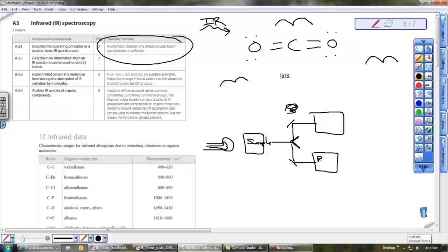Signals will go through a reference sample. That's your control. It's a comparison. It's a calibrated thing where it's like, okay, this is what a baseline is, and your sample, excuse me, this is incorrect. I shouldn't have put the sample there. That's the beauty of this comment.